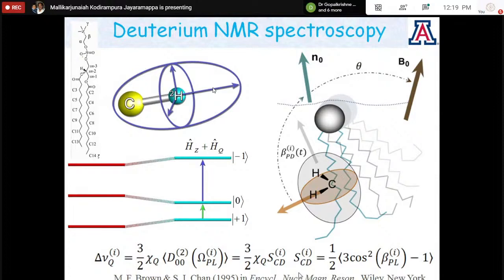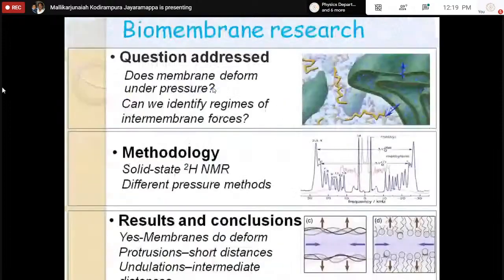The bottom line here is, because our entire molecule consists of a large number of hydrogens, we want to make measurements only for a particular segment. Even by measuring the NMR signal at a particular segment, we can connect those properties with the entire bulk nature of the given molecule.